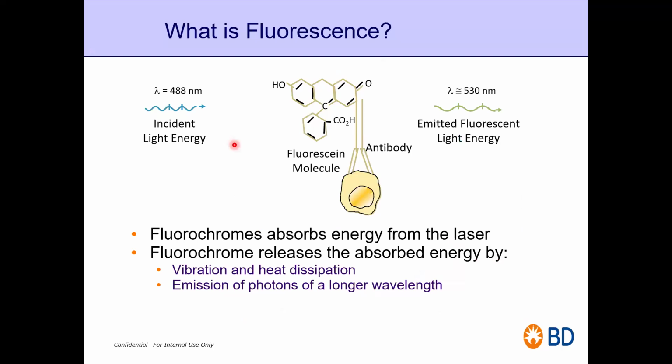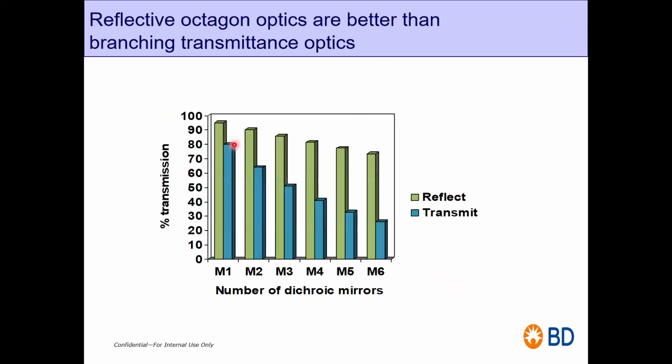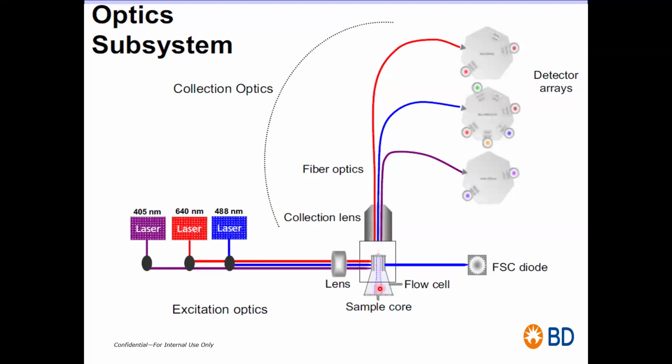Fluorochrome or fluorescence, I already discussed, and I already told you what it means and why it is necessary. It's necessary when your sample is tagged with a fluorochrome and you hit it here. The fluorochrome absorbs the light, goes to its excited state, and comes back to its ground state. At that time it will emit some energy. That energy comes in terms of photons, in a packet of photons, and those photons will transfer here, and that's how you get your signals.